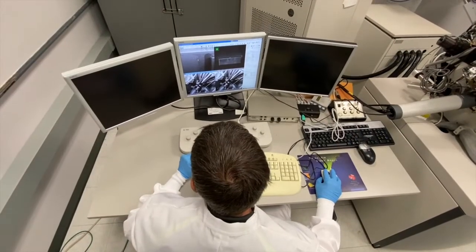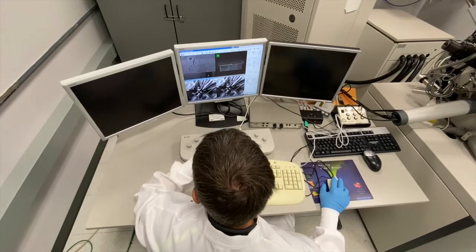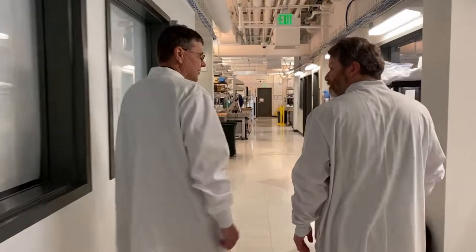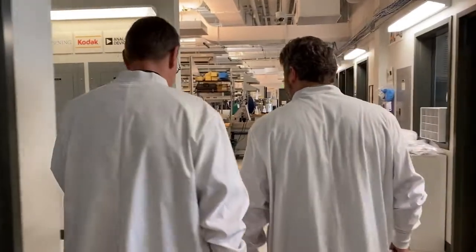We had a customer that was having whisker growth on one of their products. So we were able to use the focused ion beam to actually cross-section one of the whiskers and down into the surface of the material from where it was growing. And we found that there was material that was collecting below that and forcing the whisker growth. They had an unstable matrix, and we basically reported that back to them, and their management then would have to make a decision if they were going to change the material set they were using.